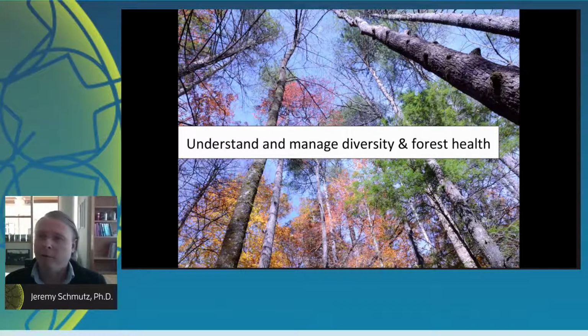We've heard a lot about forests this year, a lot about how we do restoration, what's going on with the forest under drought and climate change, and we don't know nearly anything about what the diversity of most of these species looks like and how that diversity changes with climate impact. And so we can sequence genomes for these now. We can look at diversity. It's just not that big of a deal. The genomics part of these projects is now small relative to the effort needed to even track these things over time.